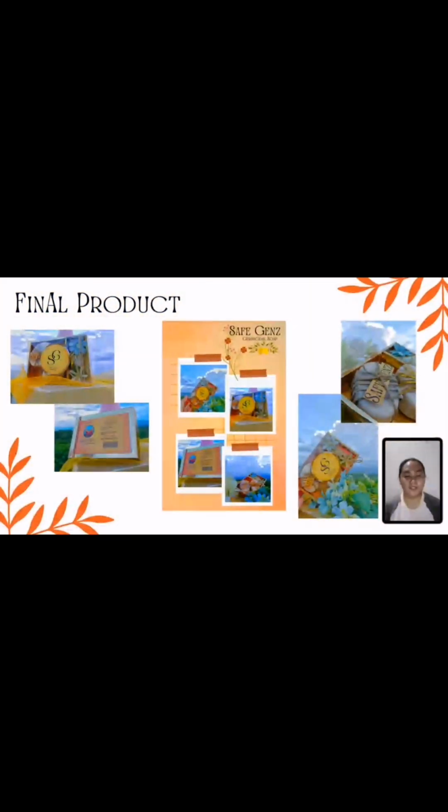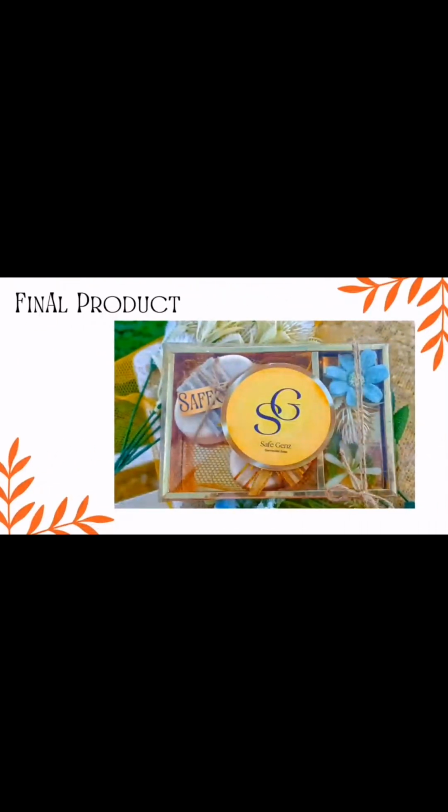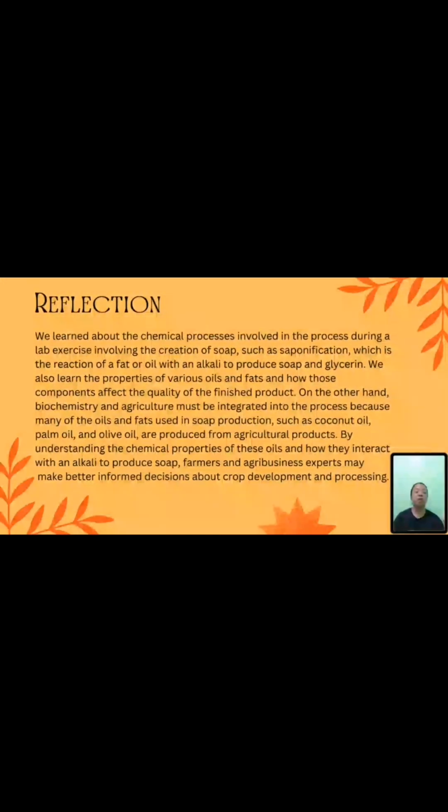Then here is the final step, which is our final product or finished product. So, pack the soap with your desired soap packaging. Then the soap should be ready to be used after the curing process. After the laboratory soap making, our group did the packaging and everything for the project.